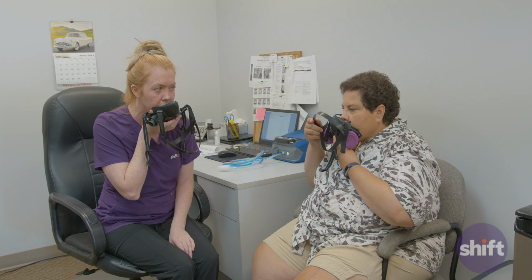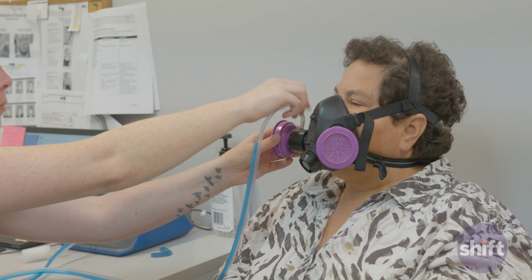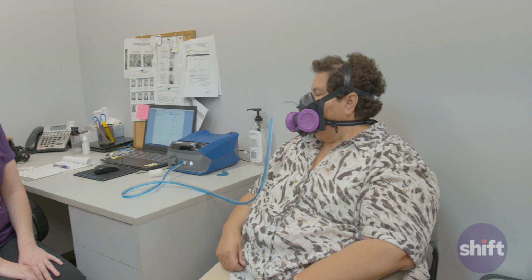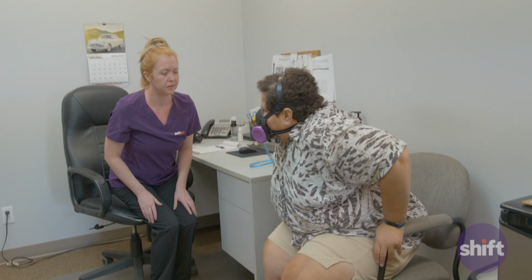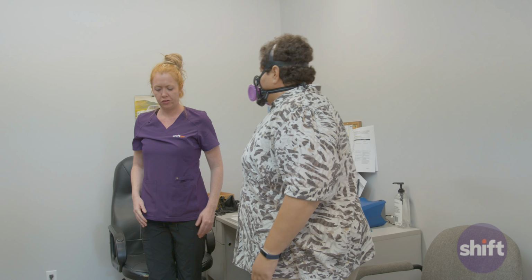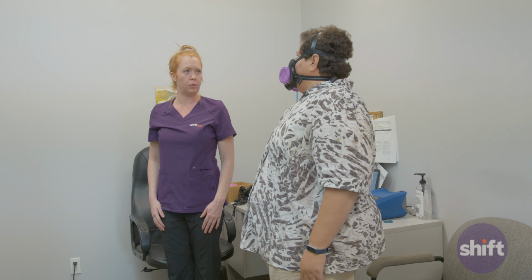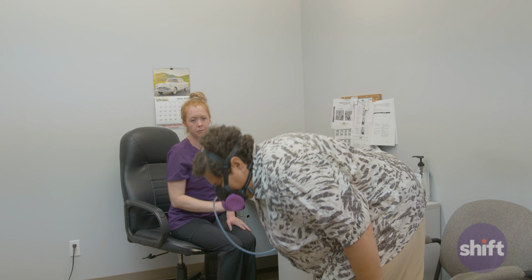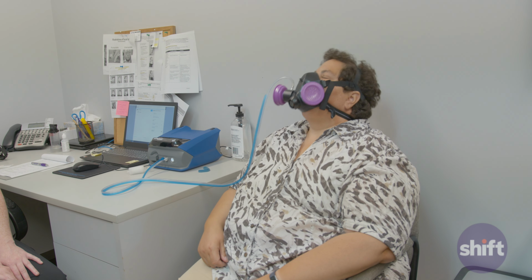The worker's information will be put into the fit testing software program and the test will commence. The worker will be instructed to complete several exercises, which will ensure the seal of the respirator is maintained while their face and body moves. These exercises include speaking, nodding the head, shaking the head, and bending over. While each exercise is being performed, the fit testing instrument measures a particle count outside of the respirator versus a particle count inside the respirator. This determines whether the particles are crossing into the respirator through a bad seal.